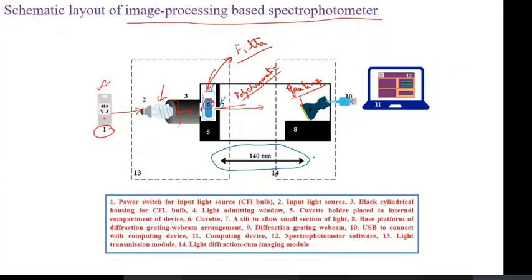If you move this grating far behind, then what will happen? There are chances that the spreading of light may happen, and if the spreading of light happens, then it will degrade your image quality. Okay, that is one of the things. Then you can play with the positioning of the grating depending upon your image sensor. Okay, am I clear? Yes, sir. Okay.